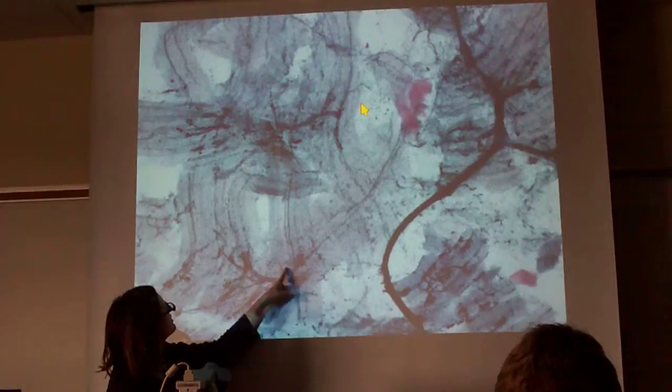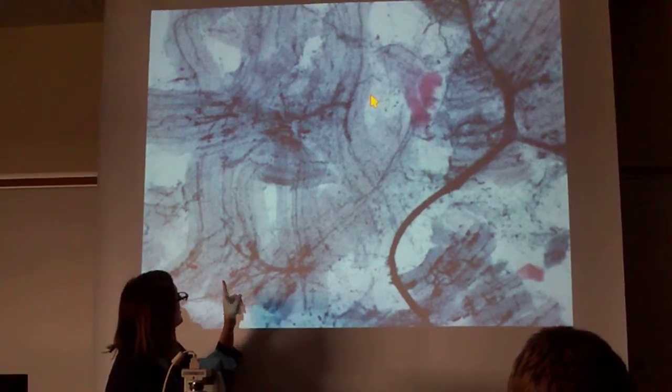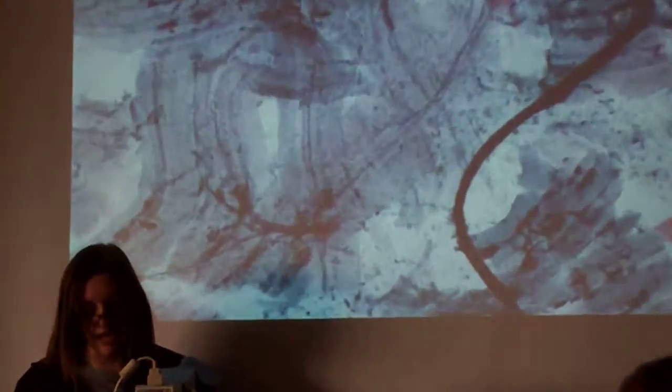We can see more up here, or you can see some of them very pronounced up there, and you can see some over here. Oops, wrong way. But that's about as good, and we can see another section over here where we're seeing all the little blobs. That's as good as we can get.